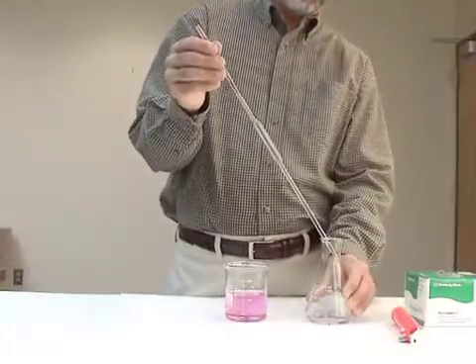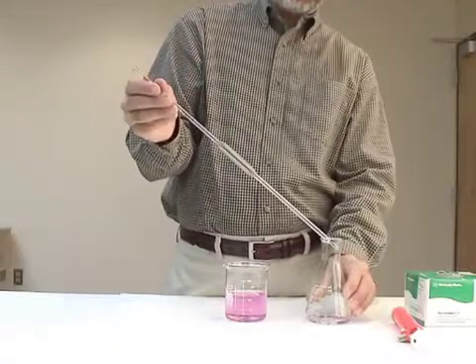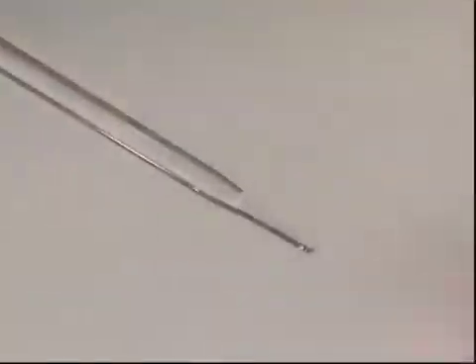When the solution has finished flowing out, there will be a small volume that is still retained in the tip of the pipette. The pipette is designed to contain this and still deliver an accurate volume. And that concludes this video on pipette technique.